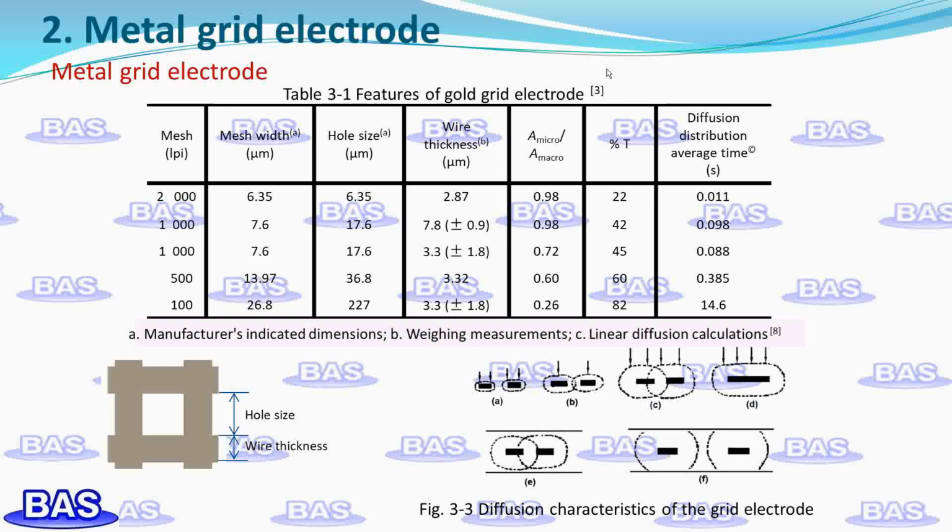The electrochemical properties of the metal grid electrode are basically similar to those of the metal electrode, so the gold grid electrode presents the positive and negative potential range of the bulk gold electrode. According to the diffusion of the electroactive material to the electrode, the uniform geometry of the grid gives it dual characteristics, which manifests as diffusion to a single wire within a short time after the potential step. As shown in Figure 3.3a, the effective electrode area is the microscopic area of the grid, A micro.